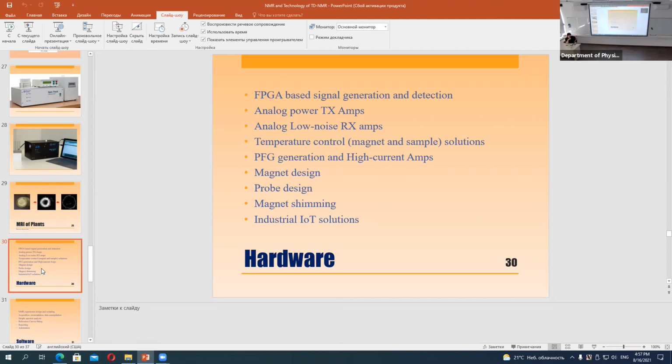So you're purchasing just some components and doing everything by yourself, right? Well, no. When you produce an instrument, you have to comply with the declaration of conformity, a lot of standards. So we are not able to produce PCBs by our hands now. We are ordering printed circuit boards, we are ordering parts of metals.